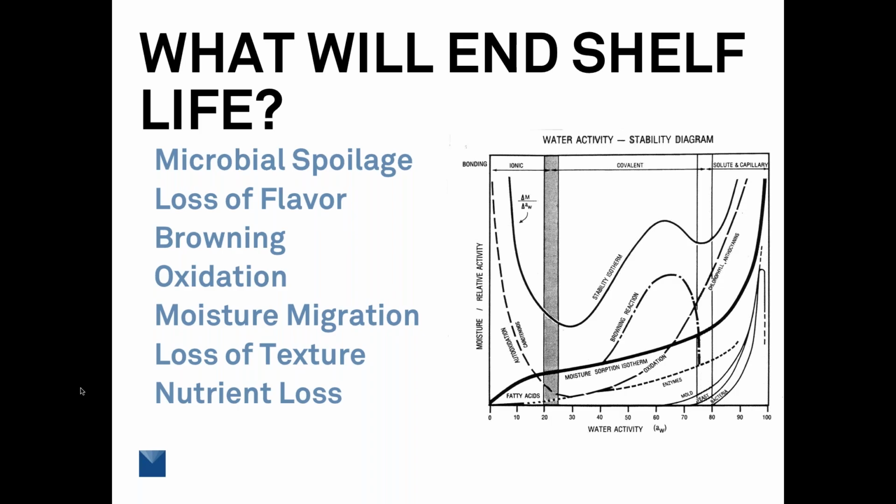So how do you wade through all these potential modes of failure? Ticking off this list and going down through the list isn't really a valid option. That's going to take a ton of work and a lot of wasted time just figuring out that each one of them may not even be a factor, that there isn't any reason to consider them as being a factor for your particular product.